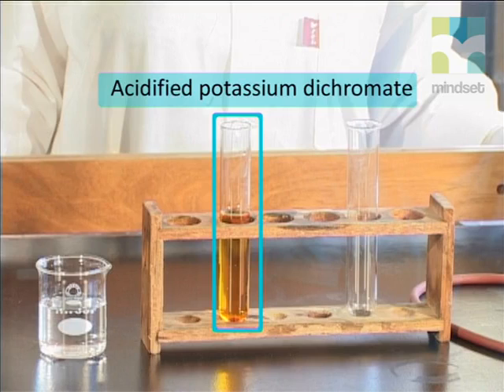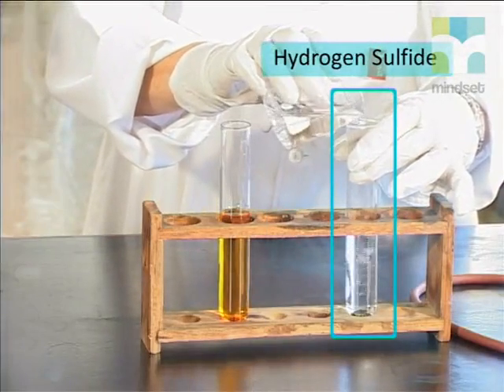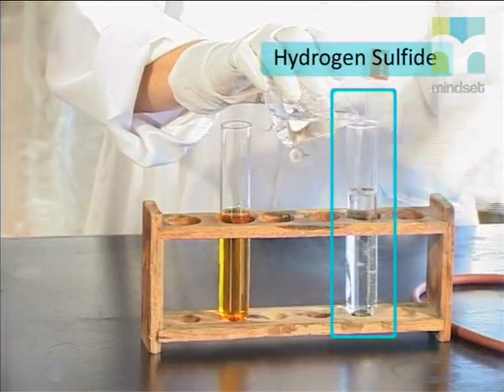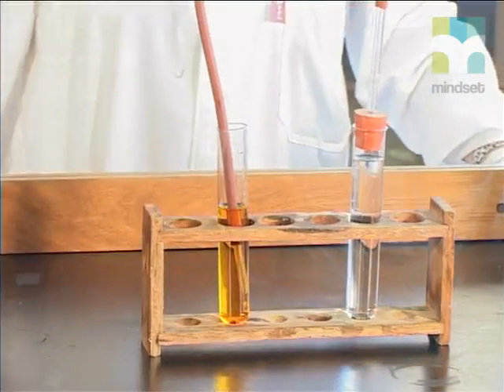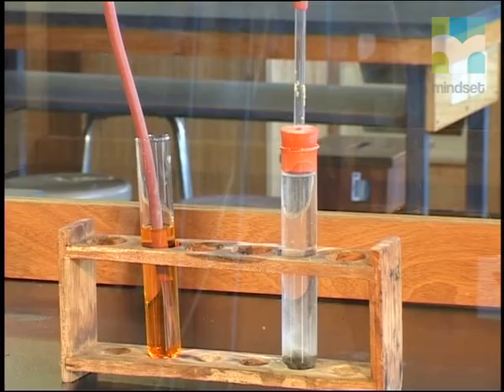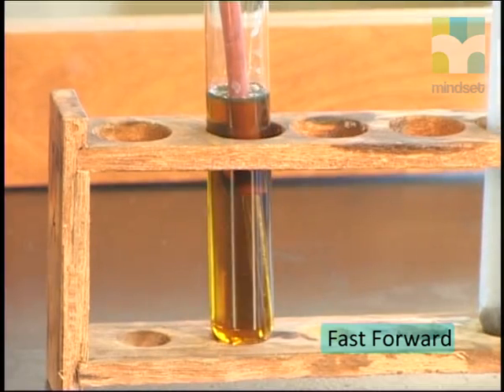Note the acidified potassium dichromate color — it's orange. Acidified means that we have added some acid to the potassium dichromate. We now add the hydrogen sulfide to the acidified potassium dichromate. Can you see any changes? We see that the orange color has turned greenish-brown.